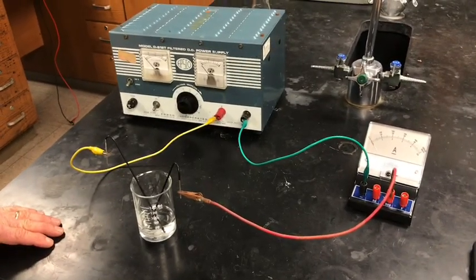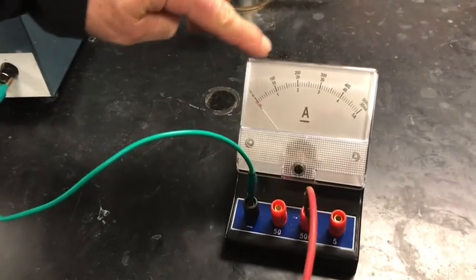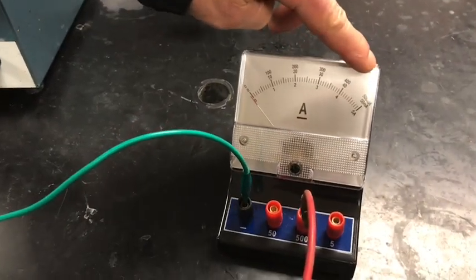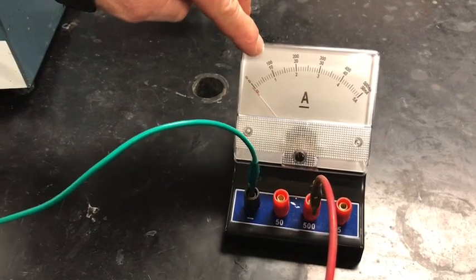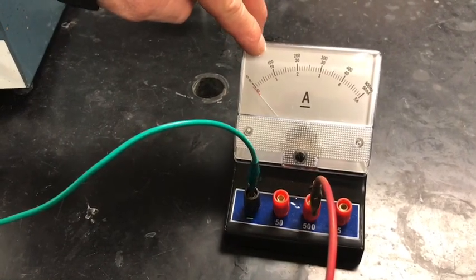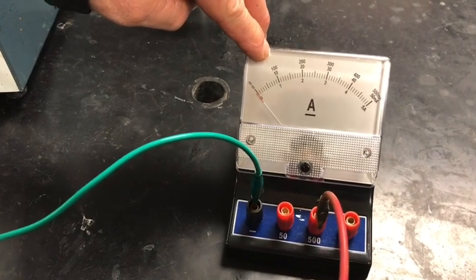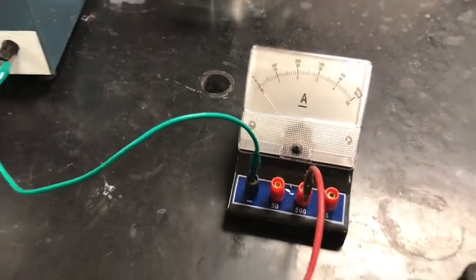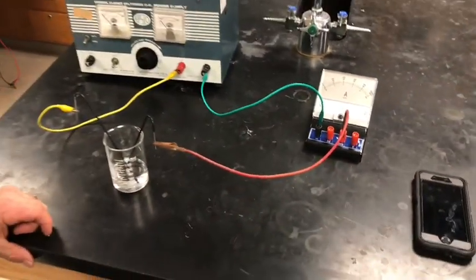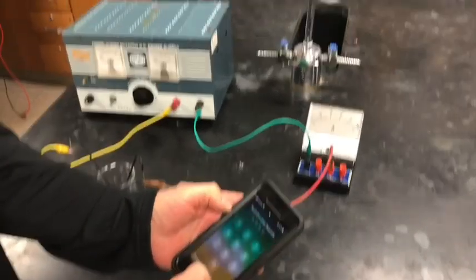We're using the top scale, which is the 500 milliamp scale. We want to use a tenth of an amp, so we're going to set the ammeter at 100 milliamps, because 100 milliamps is 0.1 amps. We've got our timer here which we'll start.